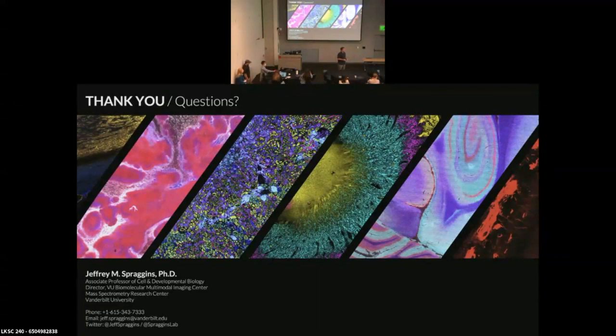There are several in here that are essentially asking about sample preservation compatibility. What can you do on FFPE? And along those lines, one of the things people have asked me about a lot is using MALDI for metabolite imaging. I've always been really freaked out to try that because I've always gotten the impression that the sample prep can be difficult. So I think there might be a lot of people curious about the complexity of that. What do you think about metabolite imaging?